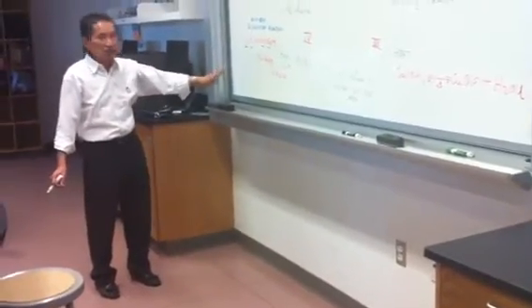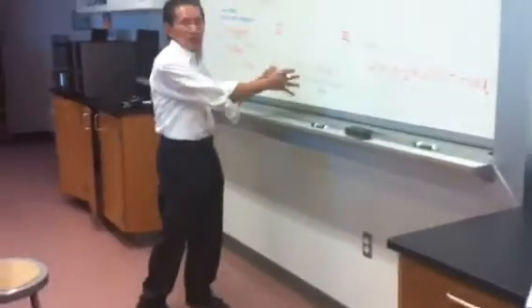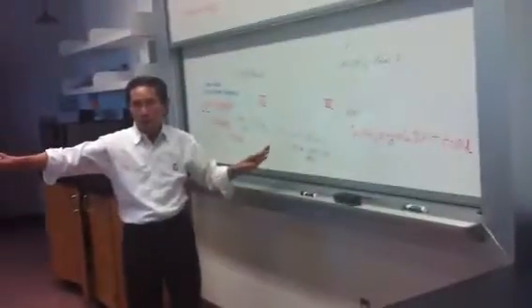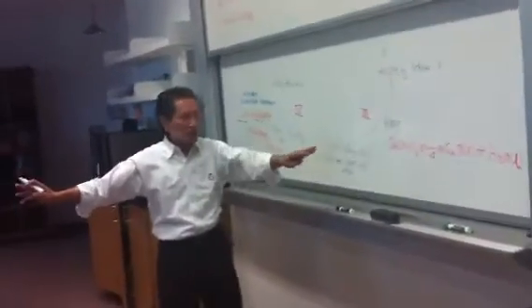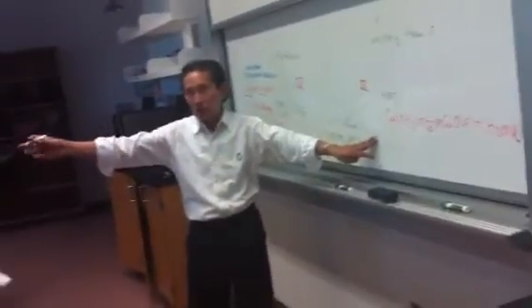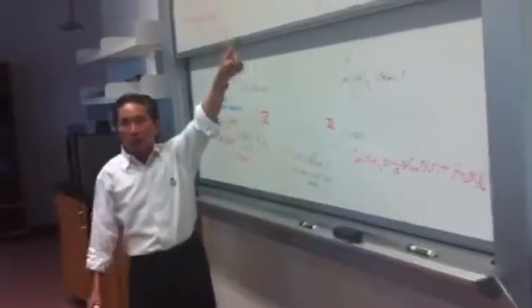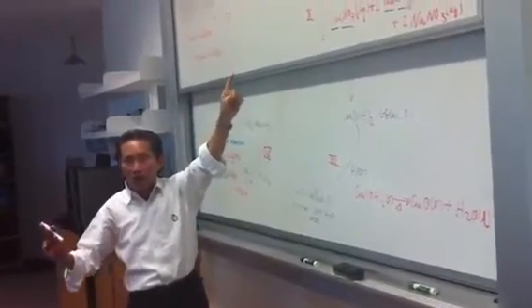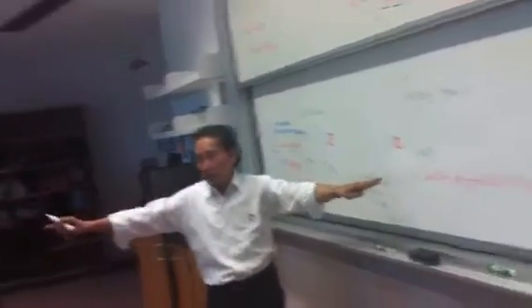Not yet. For your heating, you are doing the conversion close to the hood. You're going to position this step close to the hood in front of you. The first step must be under the hood. The second step, you're going to hold.